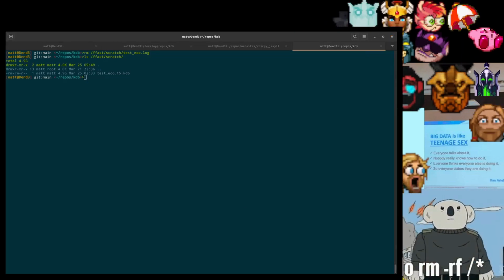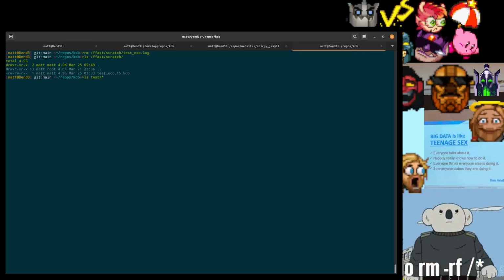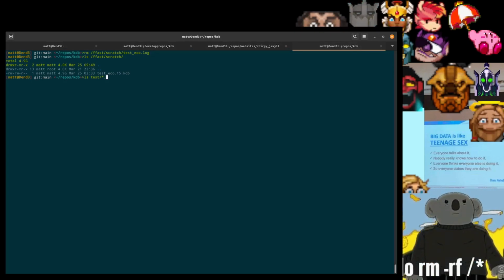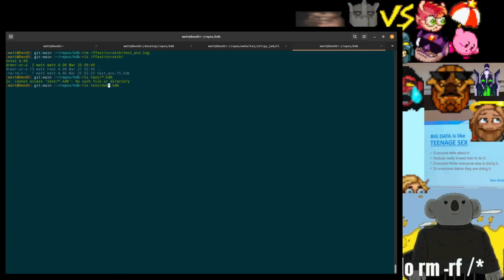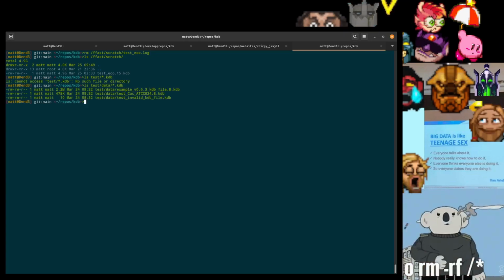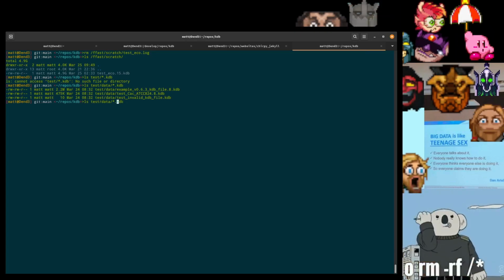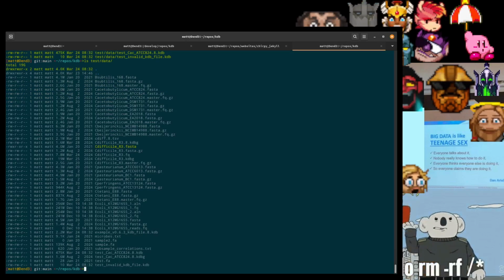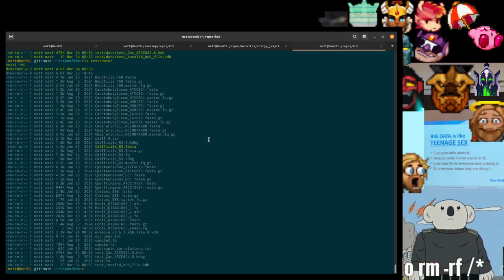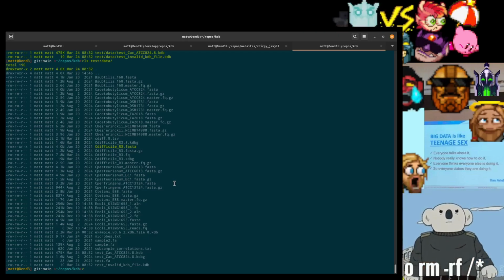I mentioned before that for some other KDB files, they can be quite large. And I think I removed most of them the other day, because they were taking up a lot of space.